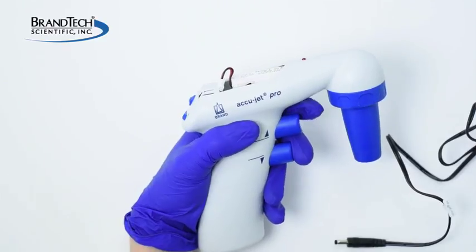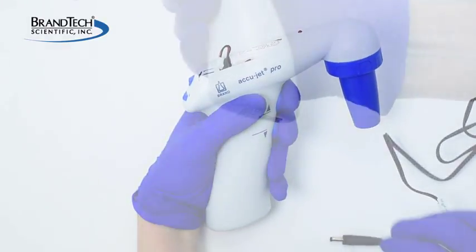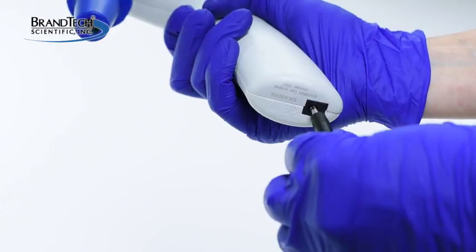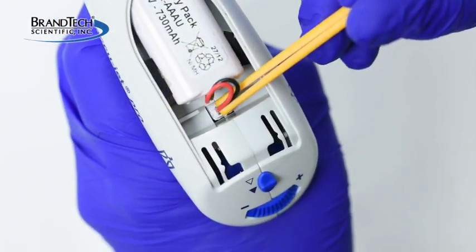Press and hold both aspirate and dispense buttons. While both buttons are depressed, plug the charger back into the AccuJet Pro, then reconnect the battery.